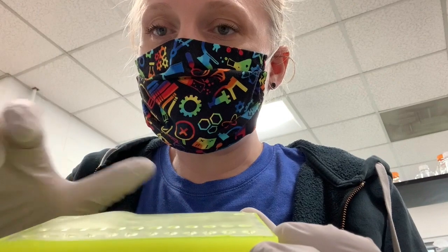So I'm using a different tip to pipette 1 microliter of each of my 12 samples into the corresponding droplet of water. Okay, so now I have my 12 droplets in my top row, and these have a 10 microliter sample in each, and that's a 1 to 10 dilution of my double-stranded RNA in RNase-free water.